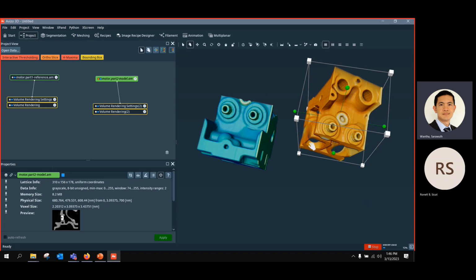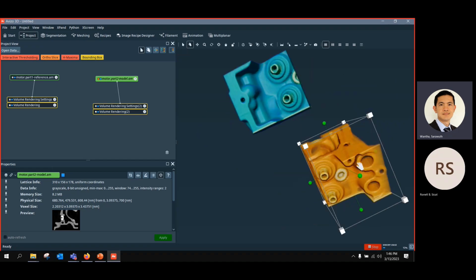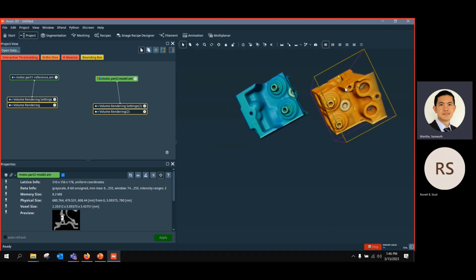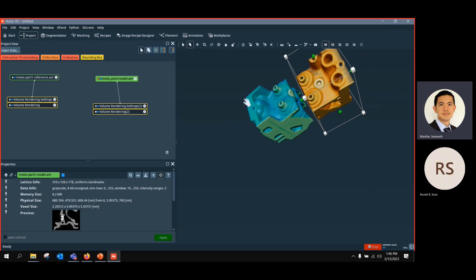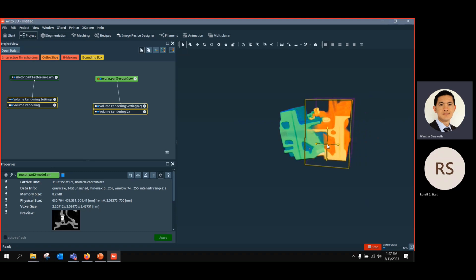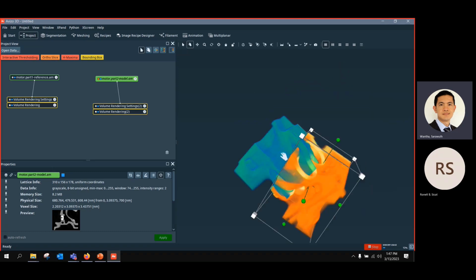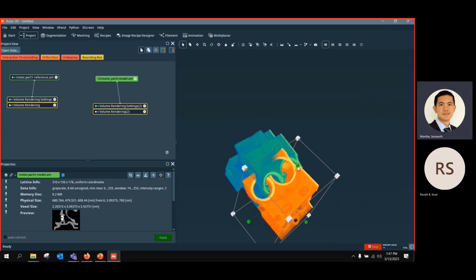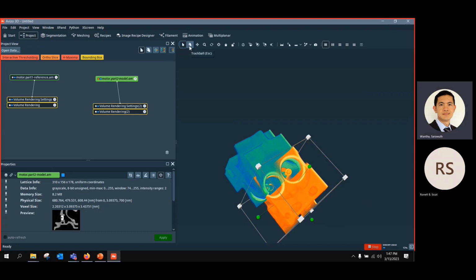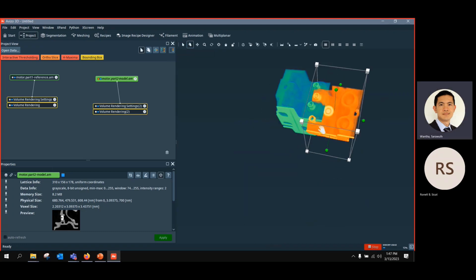Now I'm going to use the shortcut you can see here. In the hand, the trackball and the interact tool, you can press escape because it's going to be easier. Now if I want to turn like this, change here, here maybe a bit more, here zoom in, zoom out. So even by hand, it's almost very easy to do this. Here, bring it close to each other. I try to bring it close to each other as much as possible, and maybe a bit more like this. Even by hand, I can almost align them, but yeah, don't do that.